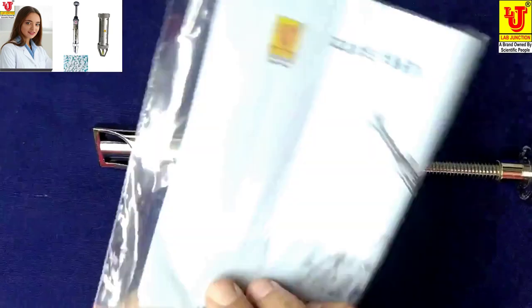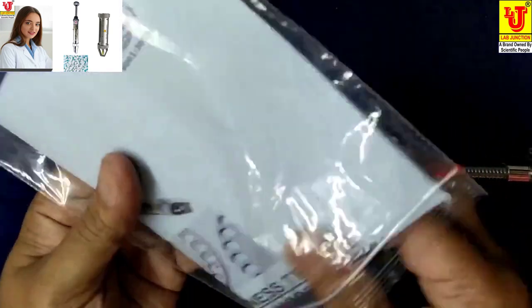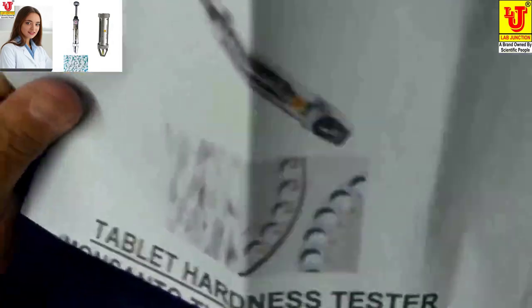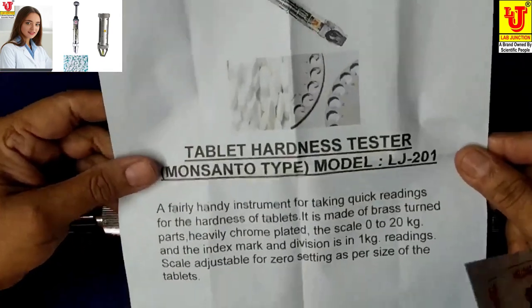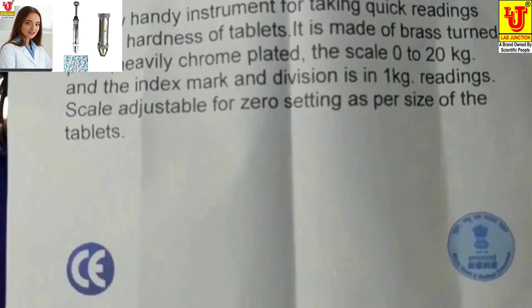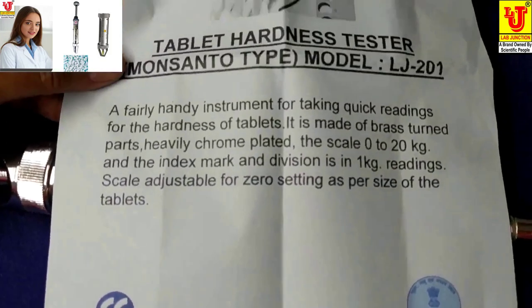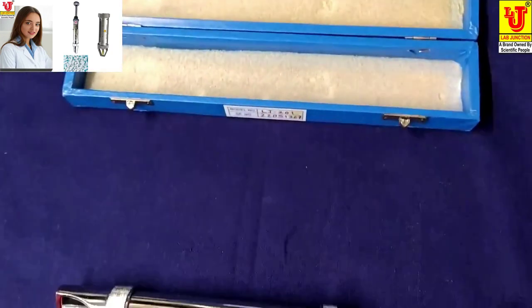This is the instruction manual. Warranty card.